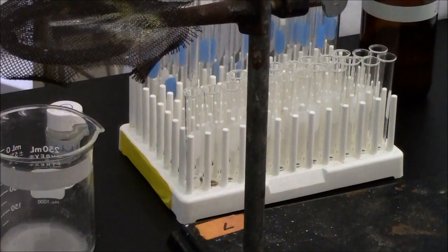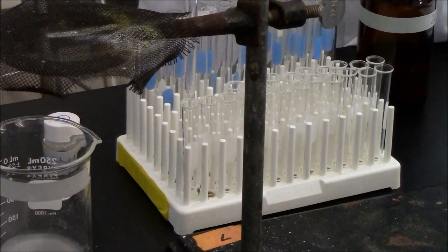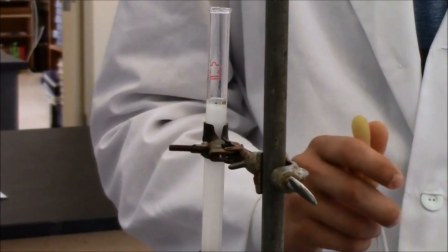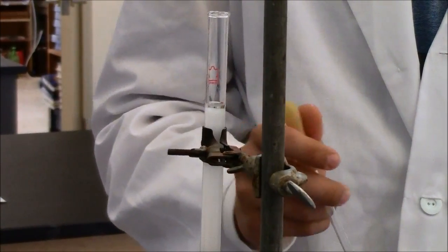So okay, add more now? Yeah, like start slowly again at first. Much more, just so we don't have to worry about it going below the silica. Right.